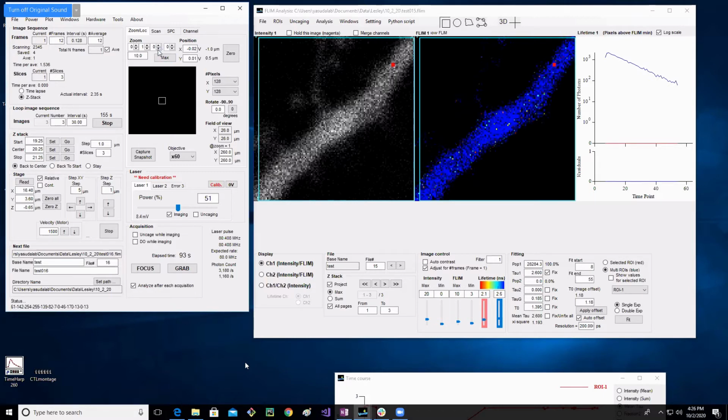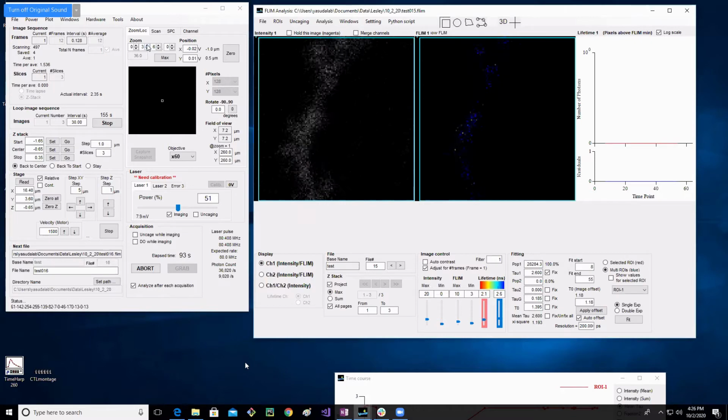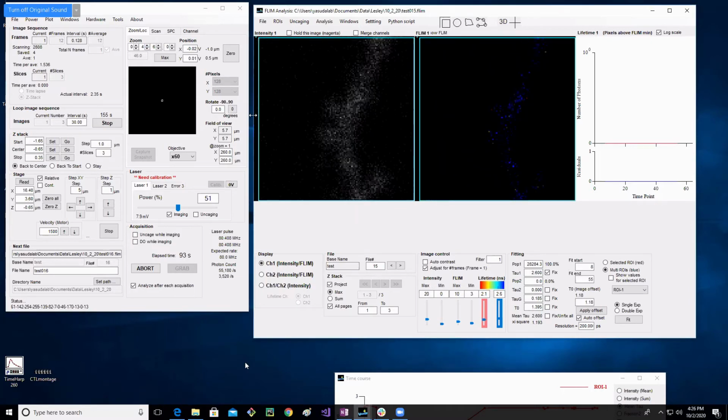Thank you. Yep. Okay, so Zoom. So why do I like Zoom so much? Zoom, of course, is important for defining what area you want to image. But one of the things that I think is somewhat underappreciated is if you have dim neurons, like I almost always do, and dim slices, the best way, if you can, to increase the brightness of your neurons is to zoom in.